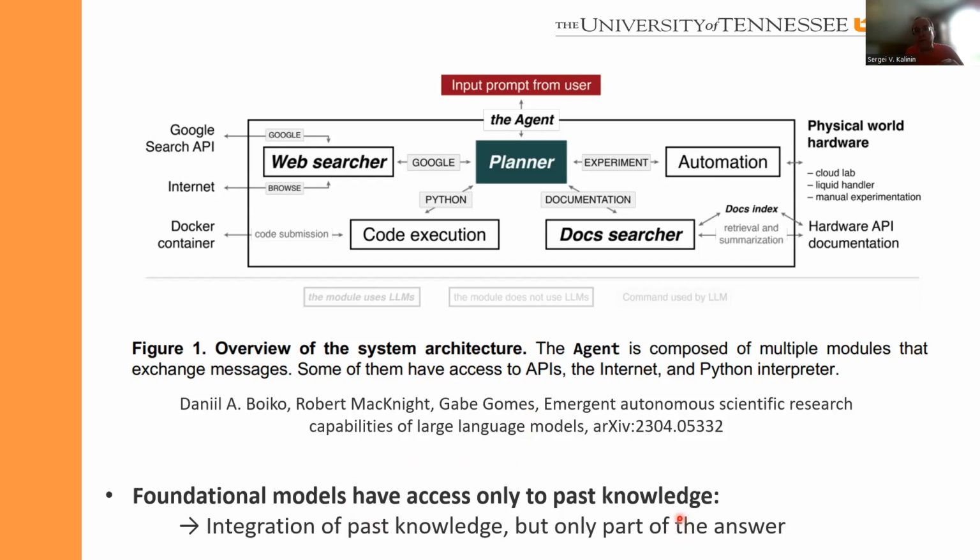If you have a fundamentally new sample under the microscope, a large language model is not going to help you choose the next location. You can use it as an advisor that allows you to ask questions like, if I want to understand the origins of dislocation activity in this material, what should I explore? But it is not going to be able to run the microscope directly, at least not in the pure form.